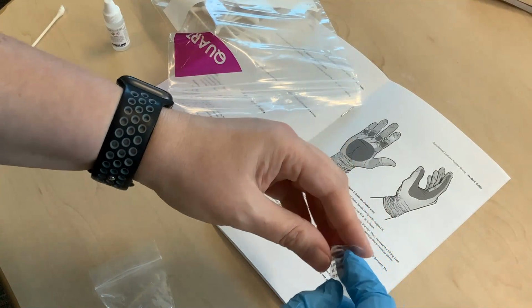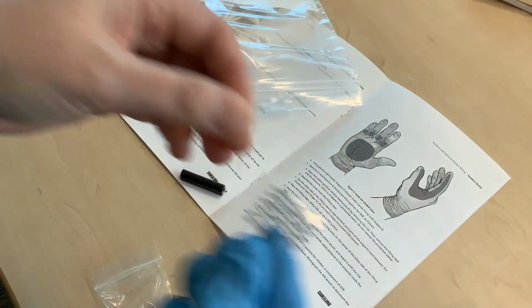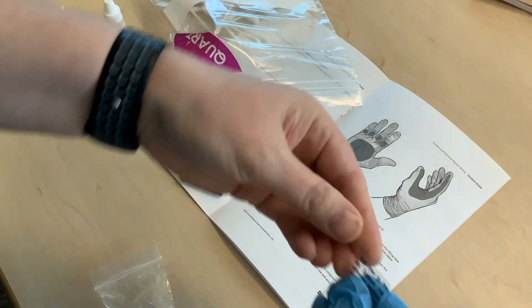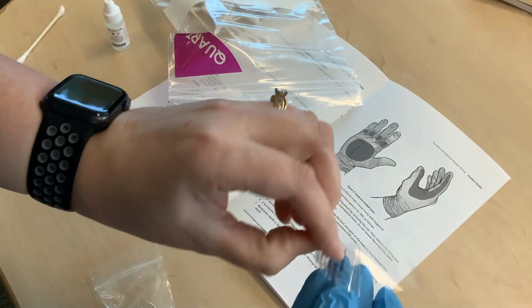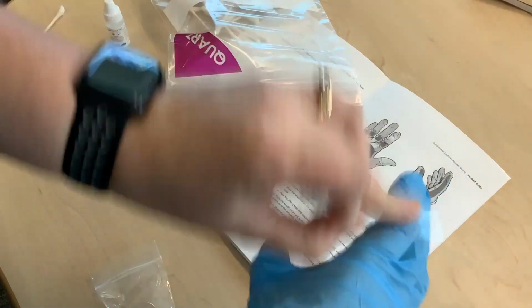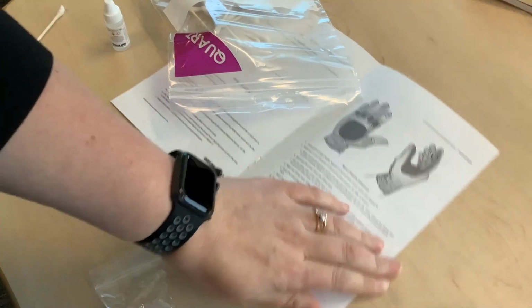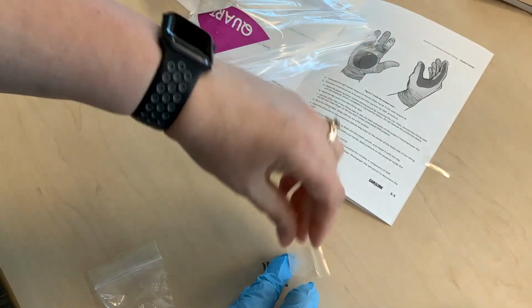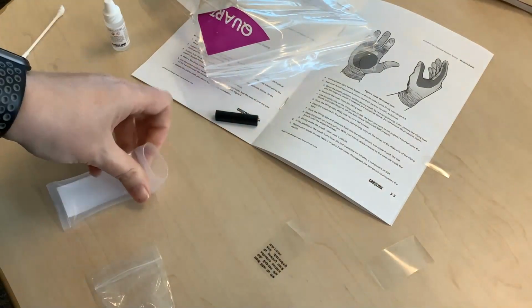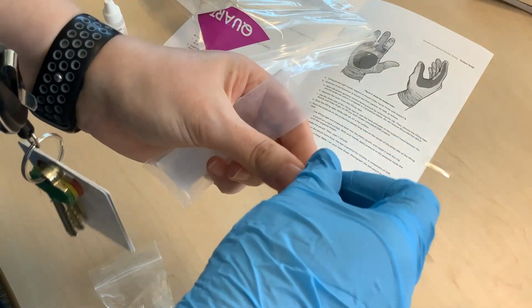If you see here, I can just bend it, and there's the cover of the lifting tape removed. Although that actually removed the entire thing, so there it goes. So I'm going to pull that off. I'm very carefully going to do this, and then I'm going to set it down flat on the table, sticky side up.